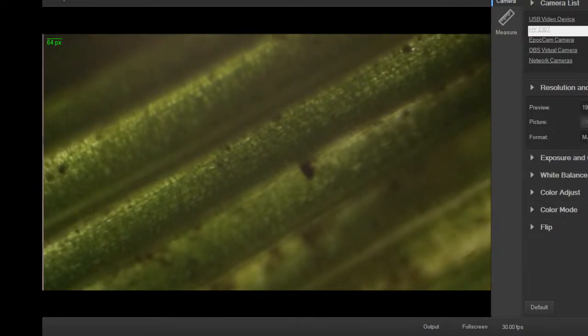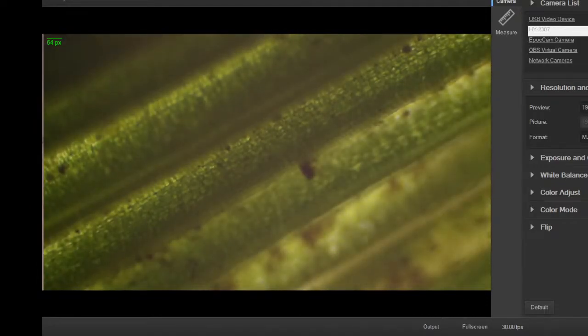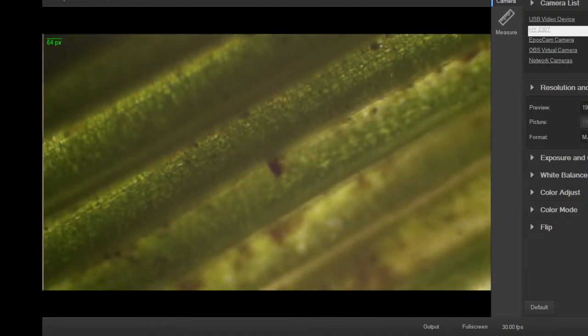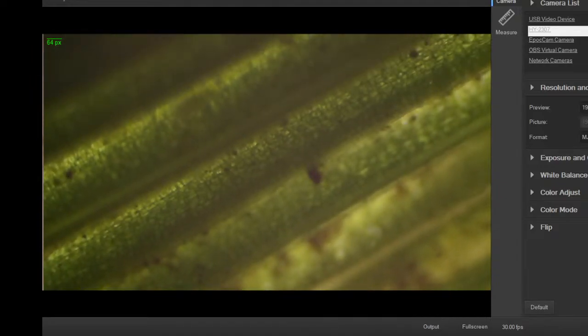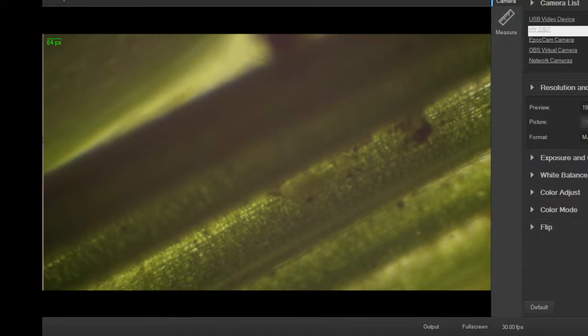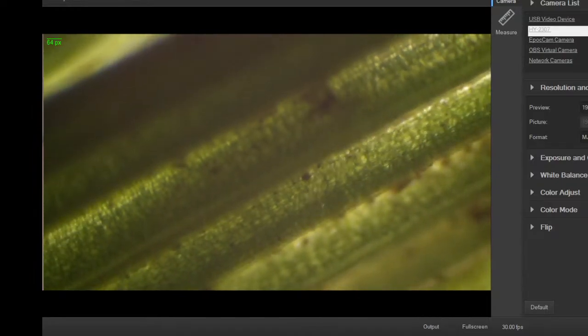It's not quite as bright here as it should be. Flood it with light as much as I can. There it is. See that inchworm movement there? It's kind of contracting and expanding. That's a rotifer climbing on the grass. So cool.